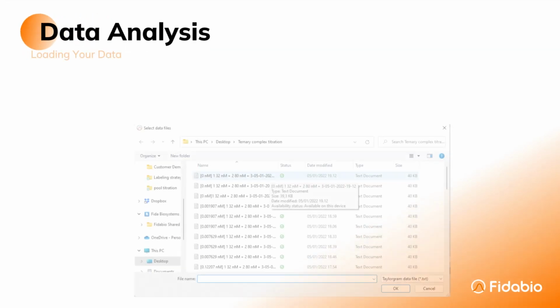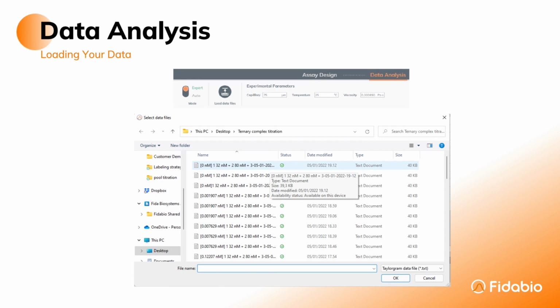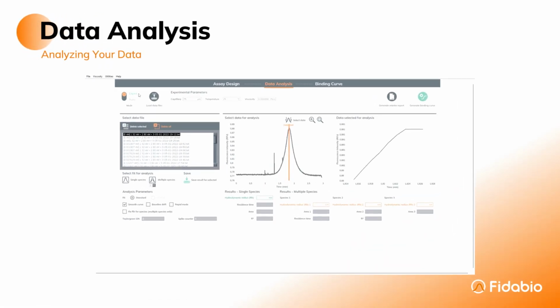Once you have run your experiments on the FIDA instrument, you can analyze the data using the FIDA software. Going to the Data Analysis tab of the software, you can click the Load Data Files button and a Pathfinder window will pop up where you can navigate to your data folder and select the data you want to analyze. Once you have loaded your data, you can then evaluate the quality of your experiment.